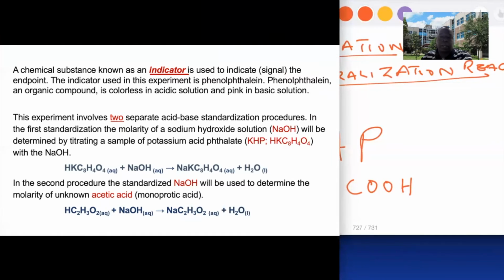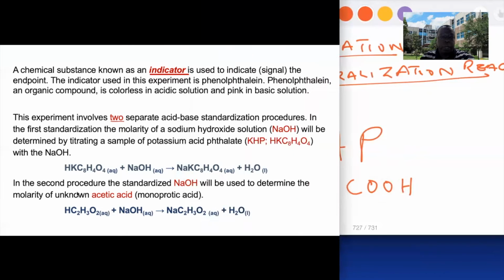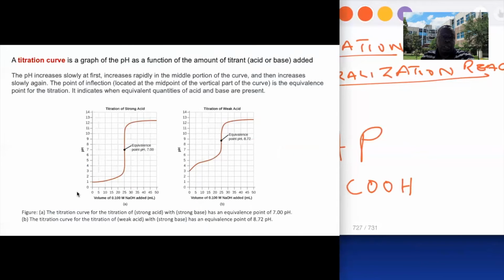It's the same thing as what you see in the PowerPoint slide on my whiteboard. That is the chemical formula. You will need this in finding the molar mass. Hope you know how to find the molar mass. You're going to need to find the molar mass of this compound down the line. I'm going to show you in Section 4.4 when we get to completing the data sheet.